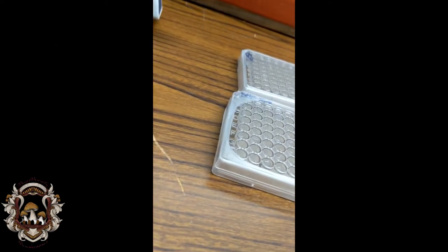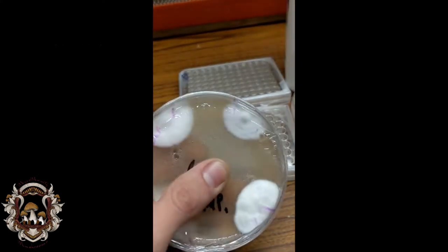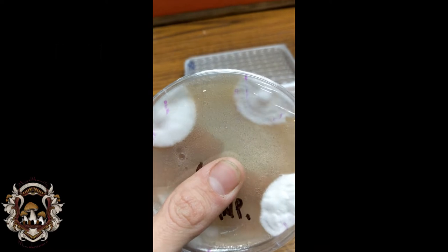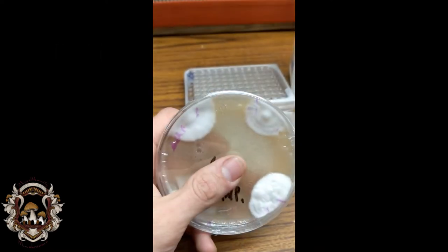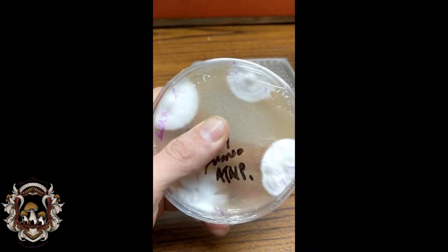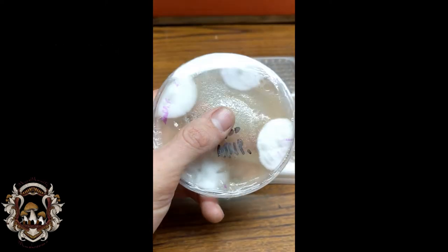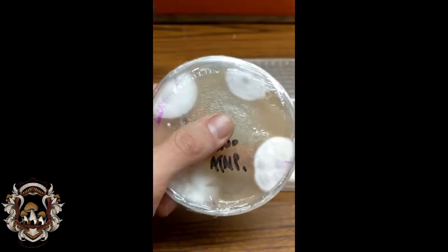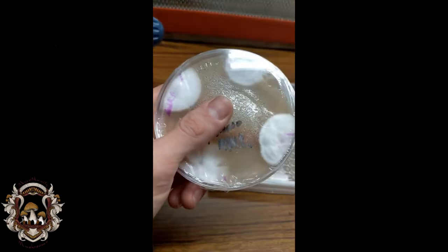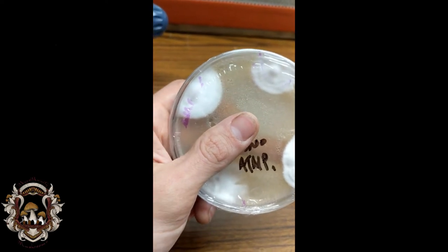Also, I did want to go back to some of the original germination plates. These came off of the original germination plates, actually. These did not come from the microplates. These specific samples came from one of the micropipette drops onto petri dishes. I transferred them onto here to let them grow out a little bit.